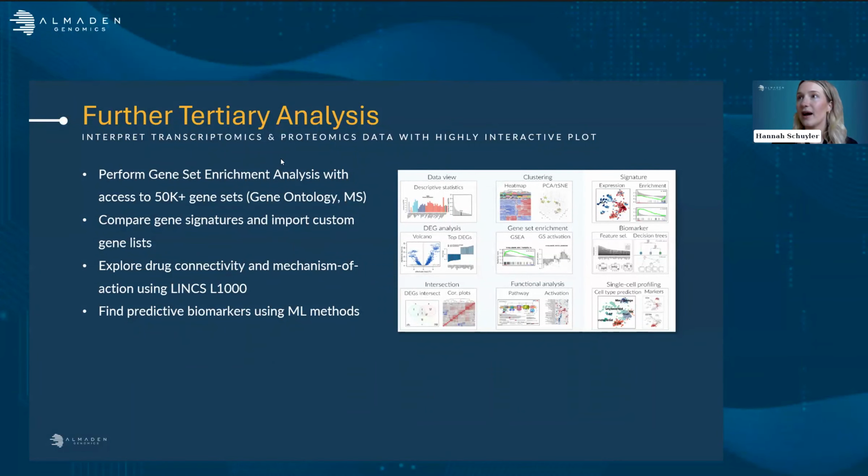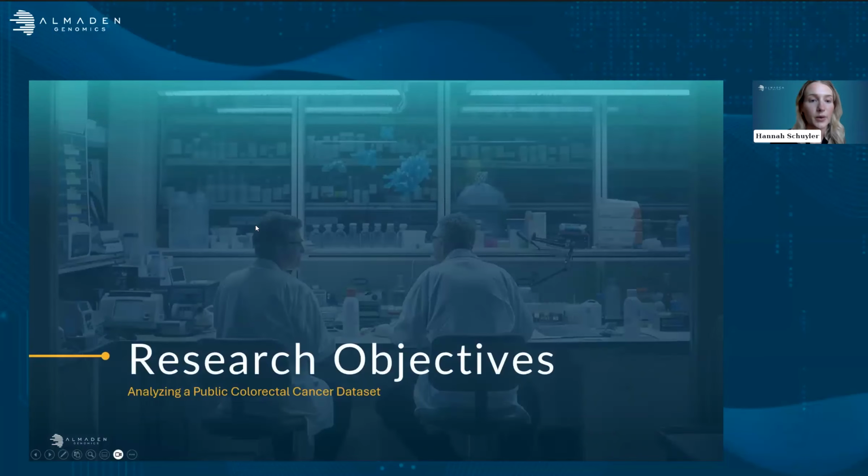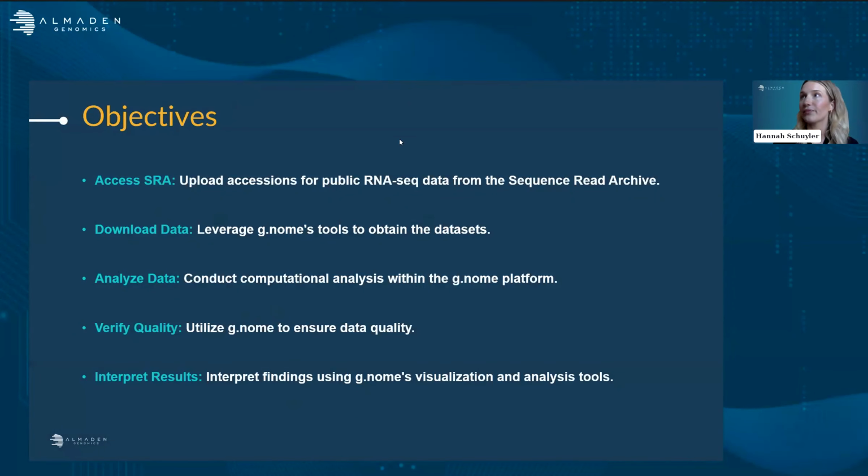With that, I'm going to pass it over to Mark to walk through the research objectives that we'll be talking through specifically with this public data set looking at colorectal cancer. Awesome. Thanks so much, Hannah.